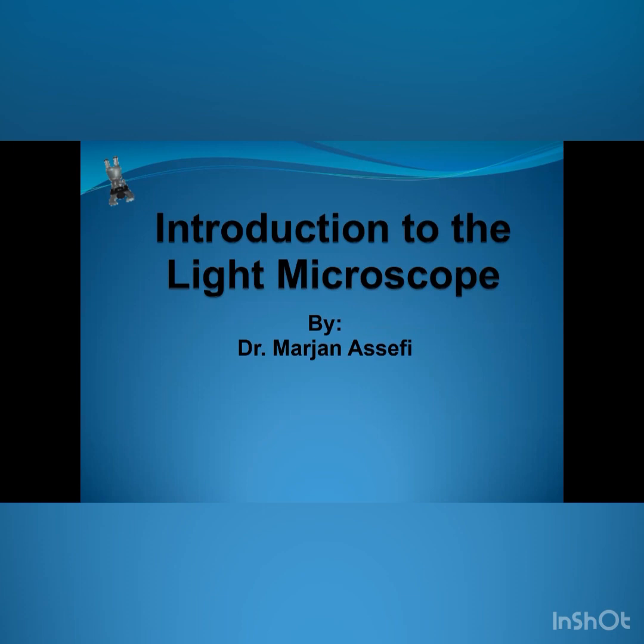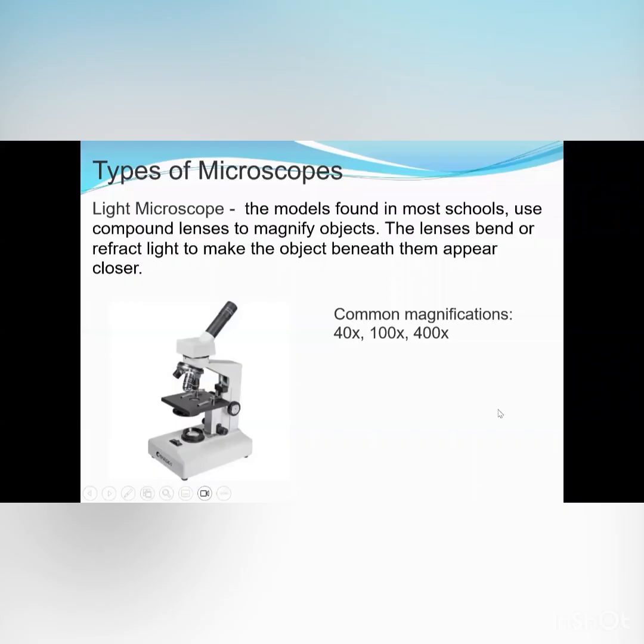We have compound microscopy, fluorescence microscopy, electron microscopy, even confocal, scanning electron, scanning tunneling, and atomic force microscopy. But today we are going to talk about light microscopy.